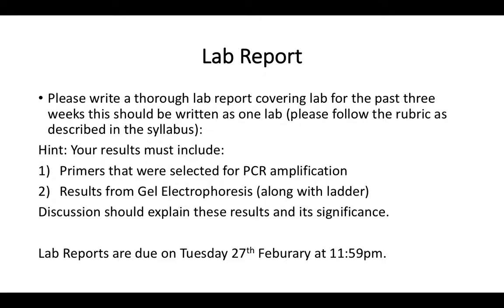So we're going to use that cartoon or that image of the standard ladder to compare our ladder that we actually run through the gel. And when we compare our ladder, we could actually compare our indentations or our measurements to the actual standard ladder's measurements, and the actual samples that we see running in the middle here will be compared to that ladder, so we could tell the actual size of our nucleotide sequence or the actual size of our gene. So after we do our estimations of the actual size of a gene, it's possible to write our lab report.